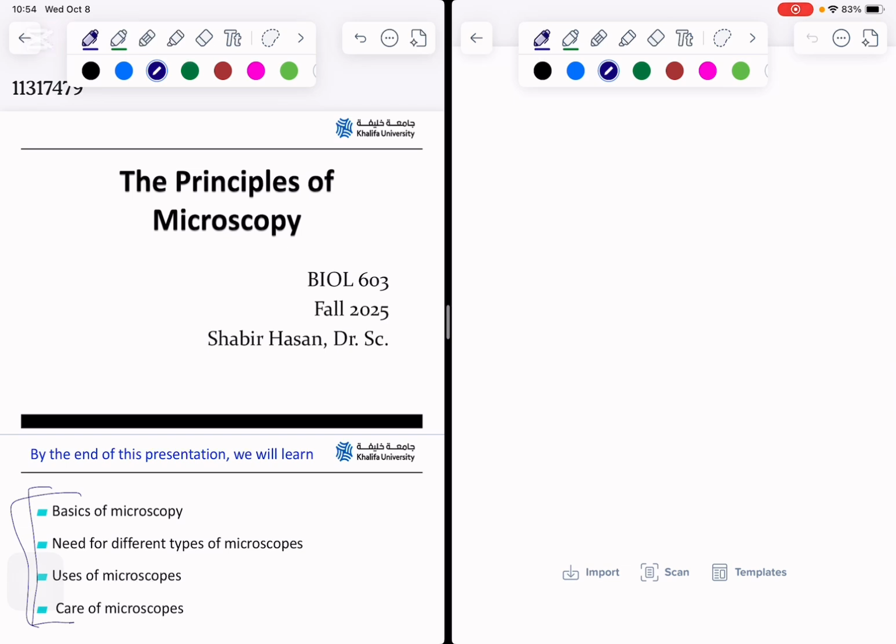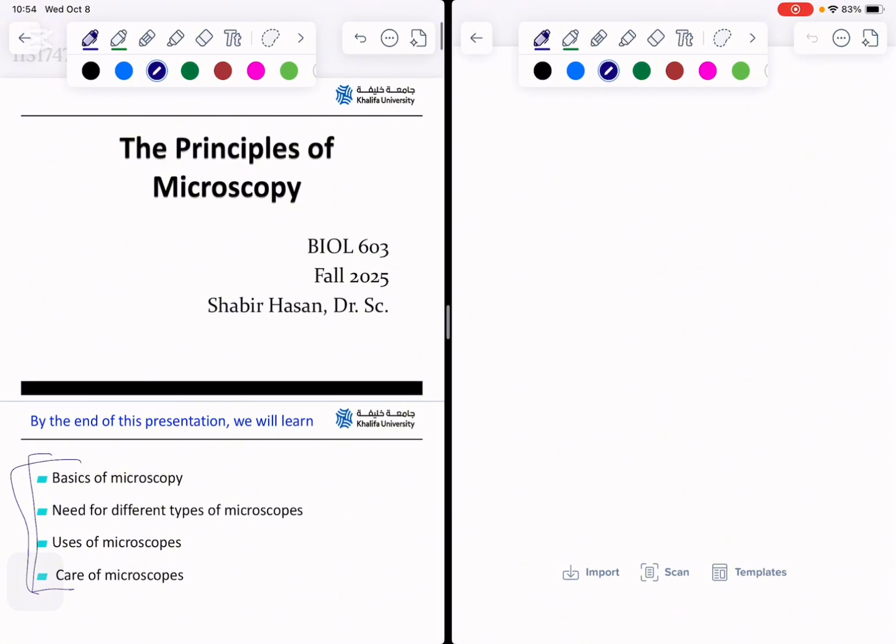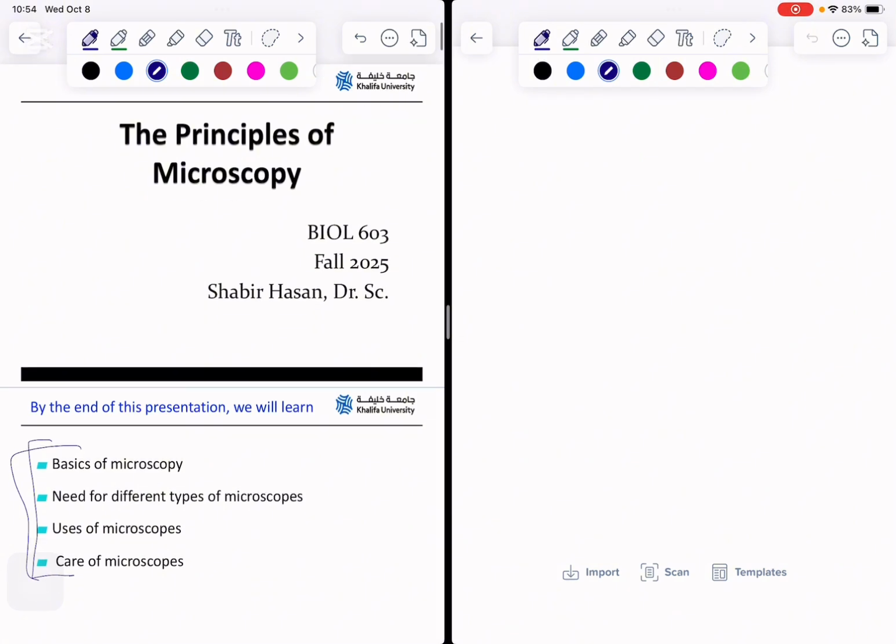I just did that. So this chapter basically is about microscopes, and there are two parts of this chapter. The first part talks about the theoretical or the mathematical part of how microscopes work, and then the second part talks mainly about the types of microscope. I'm not gonna go over the types because I'm pretty sure you guys have been bored of this throughout your undergrad life. So I'm gonna explain the first part.